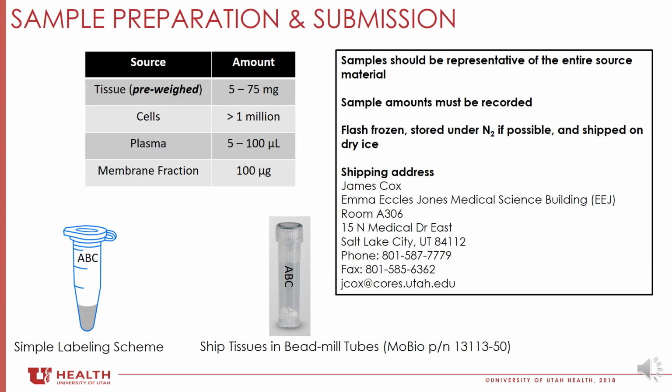Sample collection is a vital part of lipid analysis. With the highly sensitive analysis methods available, only a very small amount of source material is needed. Two points should be kept in mind. One, the small quantity of sample taken should be representative of the entire source material. And two, just enough material, but not too much, should be sampled for all of the planned analyses. What is enough material? There is no clear answer for this, as all source material will vary.